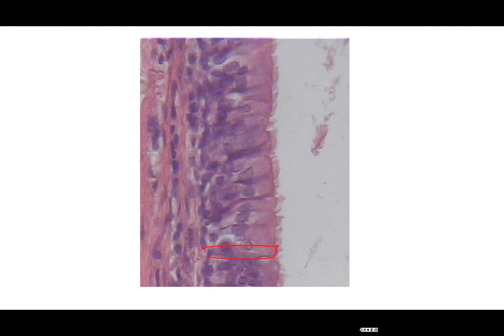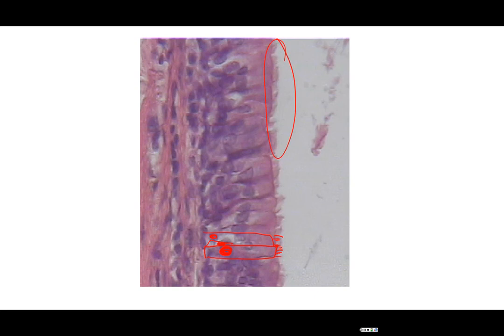Here is our picture of pseudostratified ciliated columnar. We can see our tall column-shaped cells and some of the smaller ones. The nuclei are jam-packed. The key thing to look for is the presence of the cilia — these little hair-like extensions of the cell modified for movement.